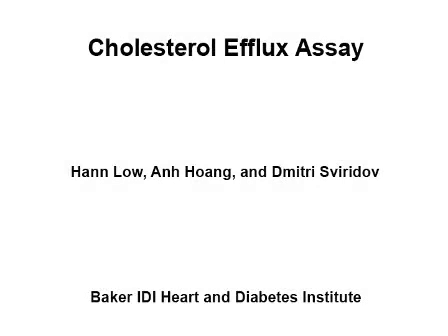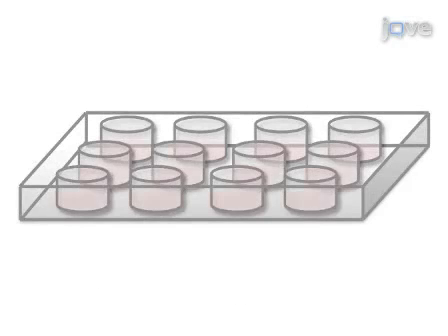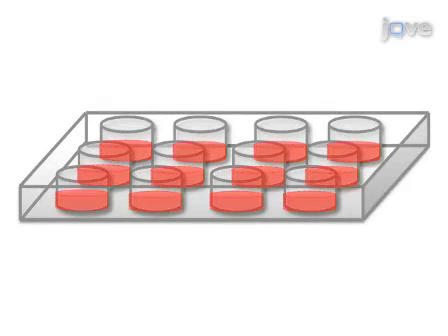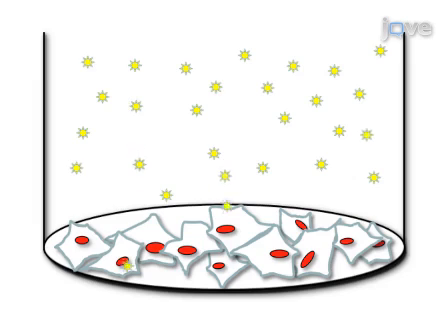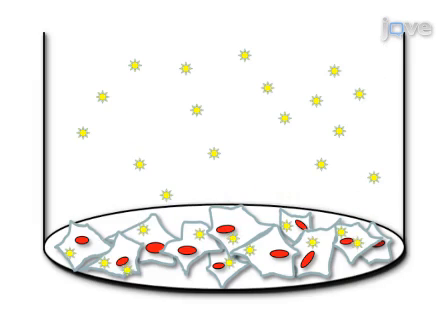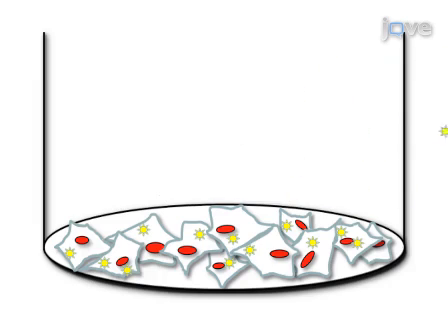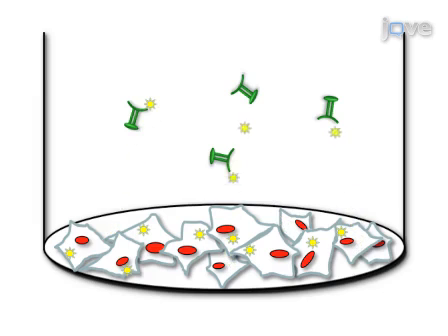The overall goal of this procedure is to measure the ability of cells to release cholesterol and the capacity of an acceptor to take up cholesterol. First, seed an even monolayer culture in 12-well plates, then label cellular cholesterol by incubating cells with tritiated cholesterol for 48 hours. Perform an equilibrium incubation for 18 hours in serum-free media with experimental drug treatments like LXR agonist or cyclic AMP. After washing the cells, proceed to the cholesterol efflux incubation with an acceptor such as plasma HDL or ApoA1.